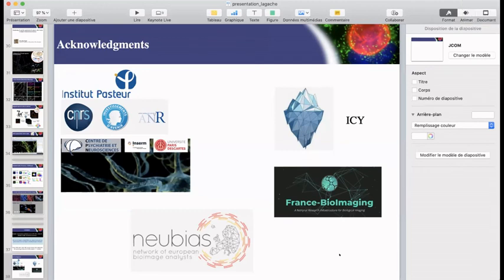There is one more question, and that says, for the formation of the annuli for non-circular objects, does it match the contours of the objects, or does it always assume circular shells? Actually, what I presented today was really based on the center of mass, so everything was circular.